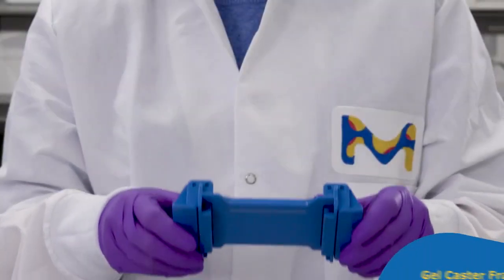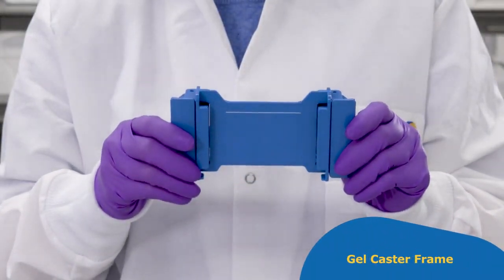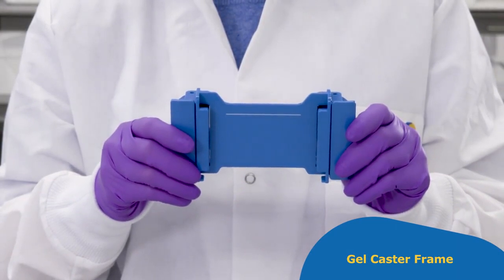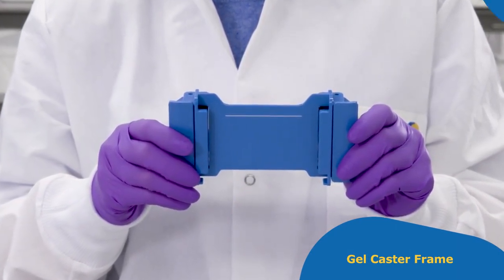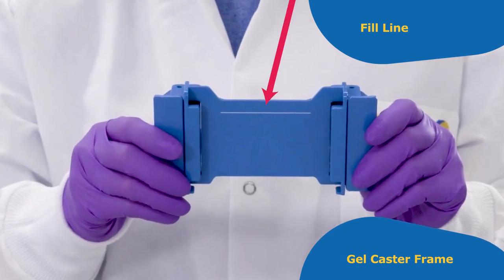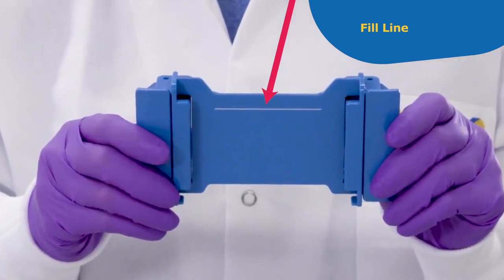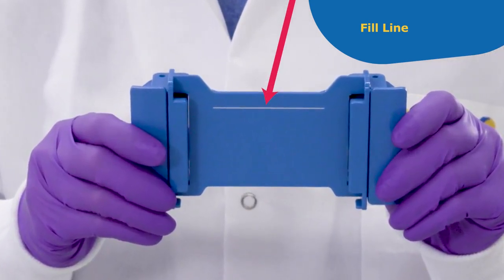The gelcaster frame evenly aligns the spacer and short plates and holds them in place for gel casting. The casting frame also displays a suggested fill line for the resolving solution, which results in a five millimeter stacker.